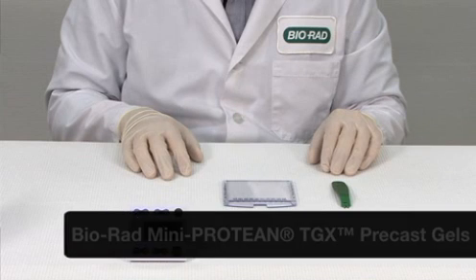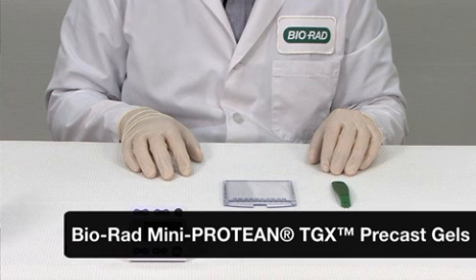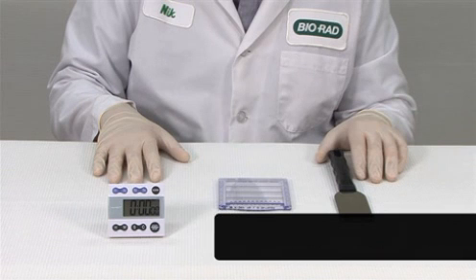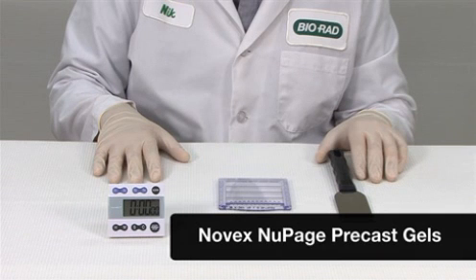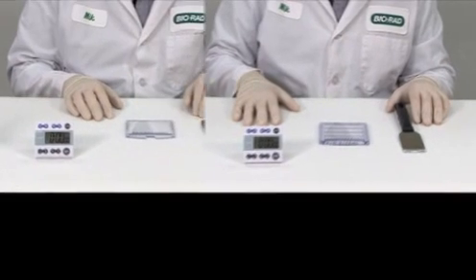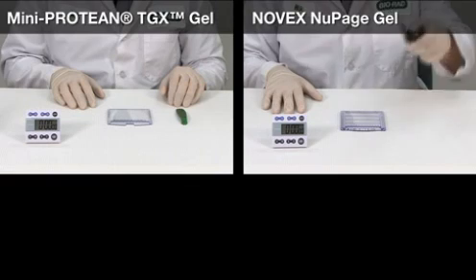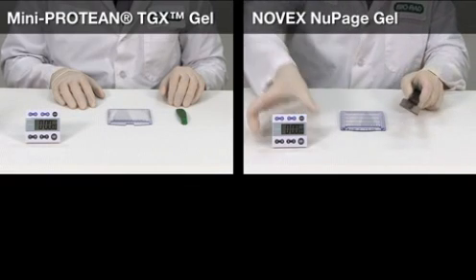To show you how easy it is to use the TGX gels, I'm going to open the gel cassette and set the gel up for a transfer. I'm also going to open and set up the Novex NewPage precast gel so you can compare the gels in this standard process. I will set a timer in both cases to help you see the difference in the processing time.